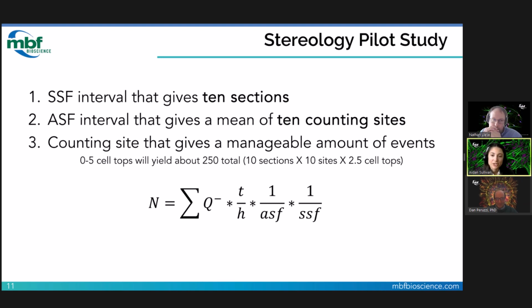Yeah, Dan, I really appreciate you showing me where the pilot study fits in within the entire stereology process. And after seeing that, I do think the pilot study is my next step. As you mentioned, I have my research question, and I know how I can answer it using Stereo Investigator's Optical Fractionator workflow. I've looked into the literature and stereology studies that have been done on my region and cell type in the past to get a sense of what others have used for parameters. But my study and treatment is slightly different, so I'm trying to determine how much to sample for my unique data. Okay, yeah, that is a good idea to check the literature. I'm glad you did that.